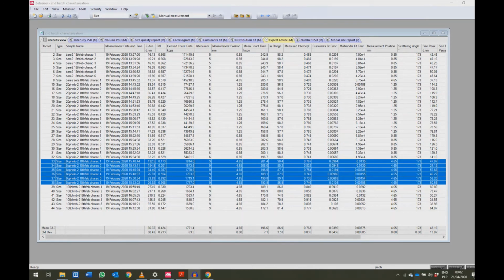So now when you go into data analysis and look across the different measurements that you took over a number of weeks, one of the things that you can look at is the change in the quality of the data. So if you noted, for example, at the beginning that the quality of the data for certain measurements was not good, you might have noted that it's because of sedimenting or aggregating or any other issue there.